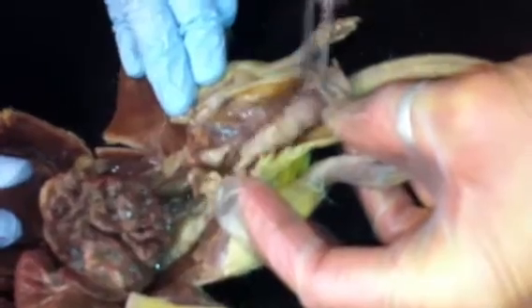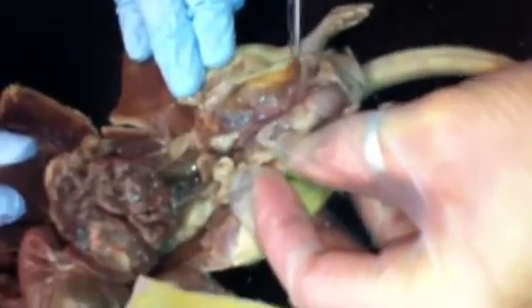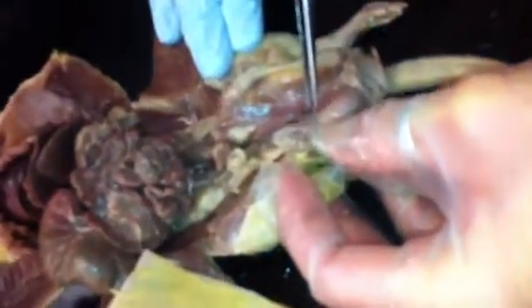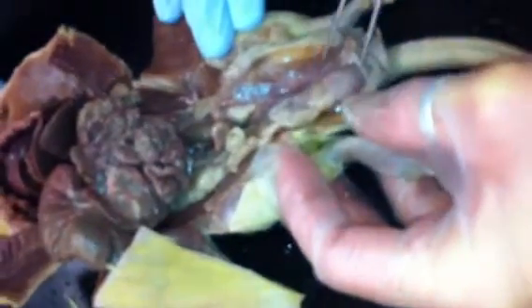So this is the testes here. Only one? No, I believe there should be a second one on this side. Okay. And then the epididymis is a little hard to see. It's a coiled... Oh, no, there it is. It's just covered with some fat. So I don't know if you can tell there's a slight texture. That's the epididymis, and then this is all fatty tissue that is just kind of on top of the epididymis there. So those are most of the organs so far, and the penis, oh, I see.